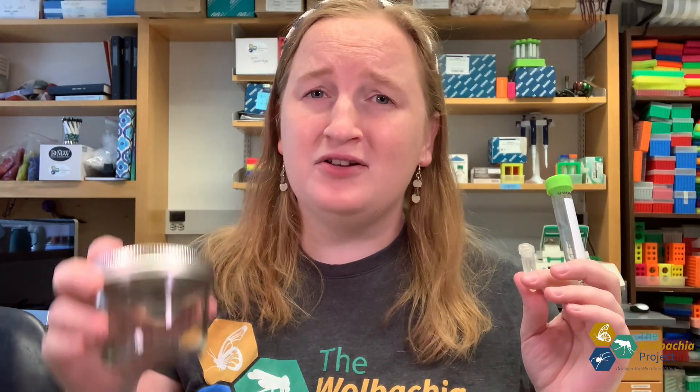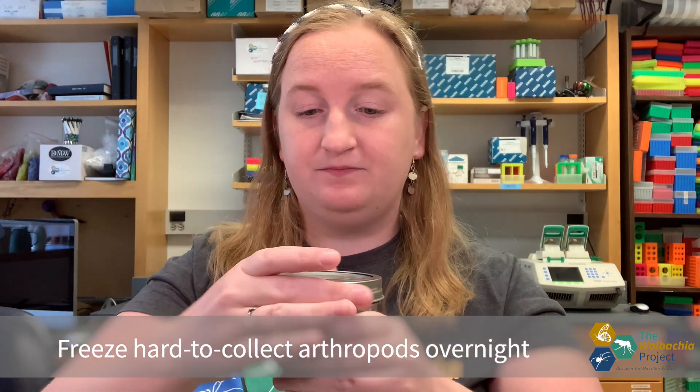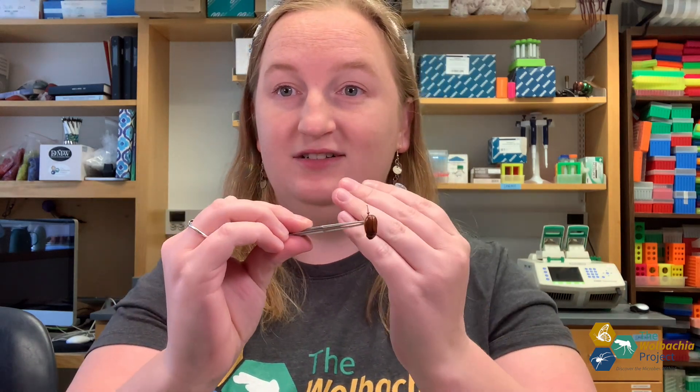If I am going out and don't know what I'm going to collect, I'll also take certain jars with me. You can see there's an arthropod I collected last week, and when I collect my arthropods, if I collect them in a jar like this, I'll trap them, collect them, and then I'll put them in the freezer overnight. Then the next day I'll open it up and take my arthropod — you can see this is a type of beetle that I have here — and I'll put it into my tube and add ethanol directly to the tube.